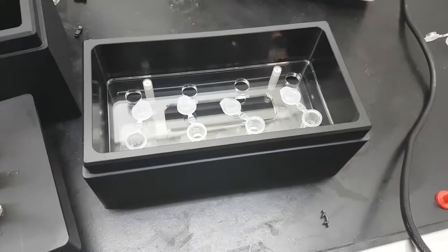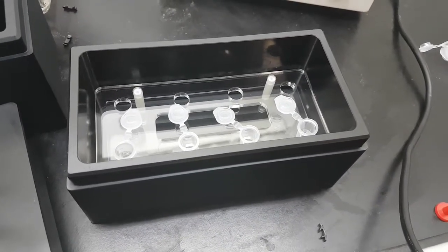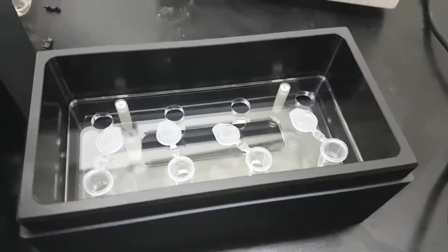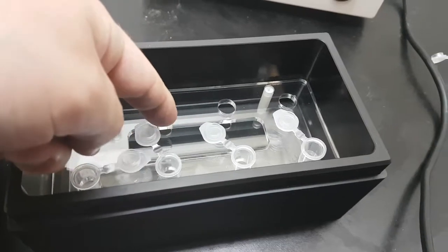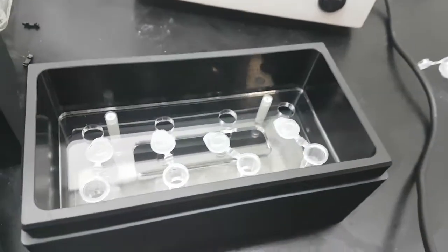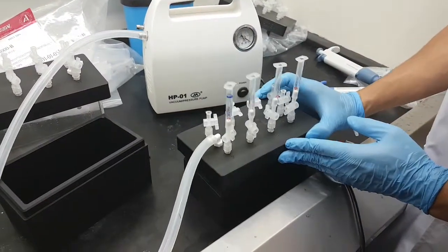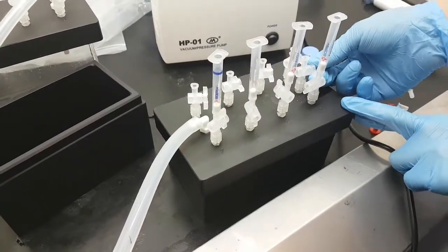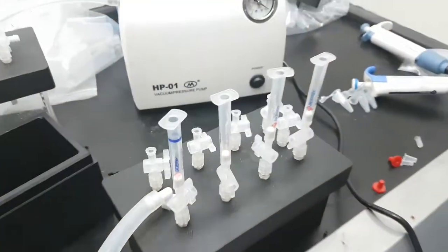Now we will place 2ml centrifuge tubes into the cover. Make sure these tubes are not touching each other, not to make it this way but to make it this way. Place the elution cover. Make pressure again.